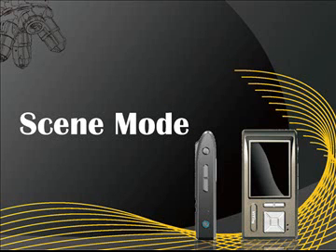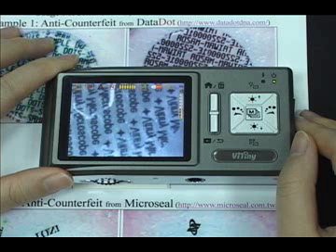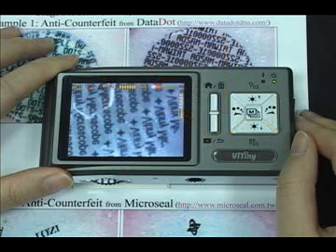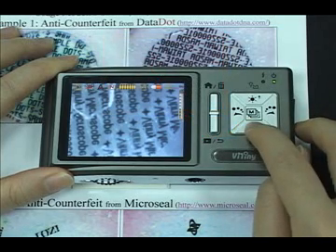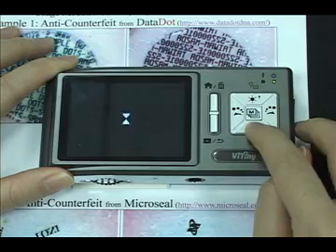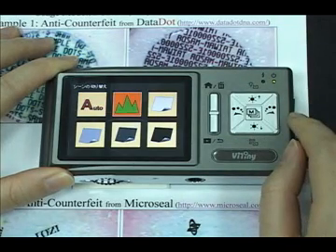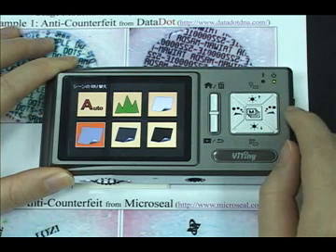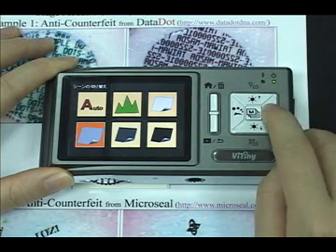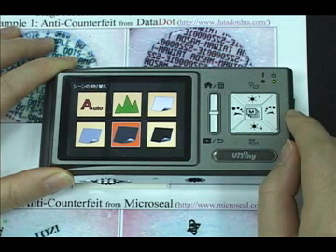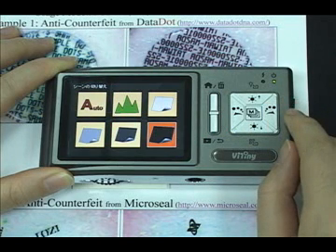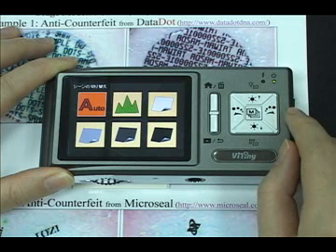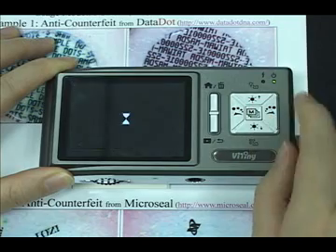Screen mode: press and hold the down button to switch screen mode. It has six screen modes — automatic mode, camera mode, white mode, grey mode, dark grey mode, and black mode. The modes can be selected according to the brightness of the observed object to achieve the optimal result.